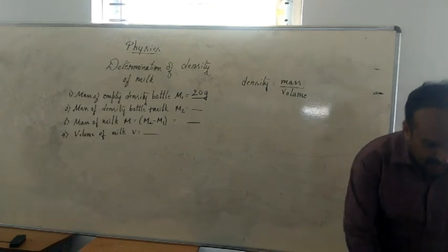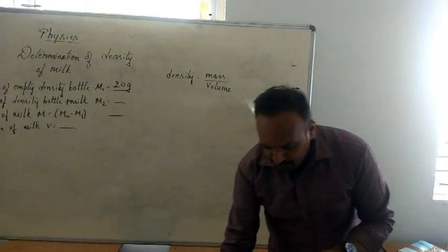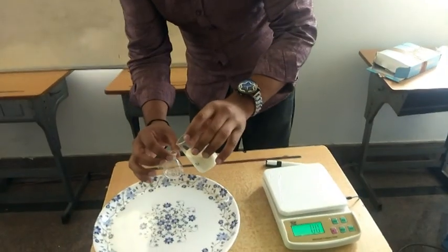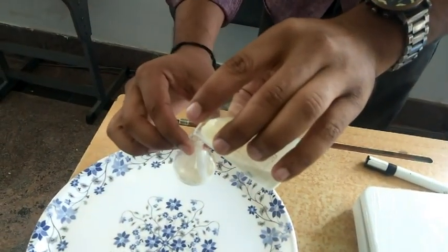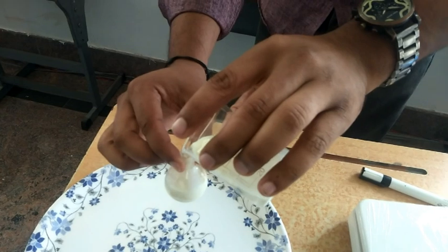Now I am going to fill this one with the milk. So let me pour it. We need to fill up to the neck.